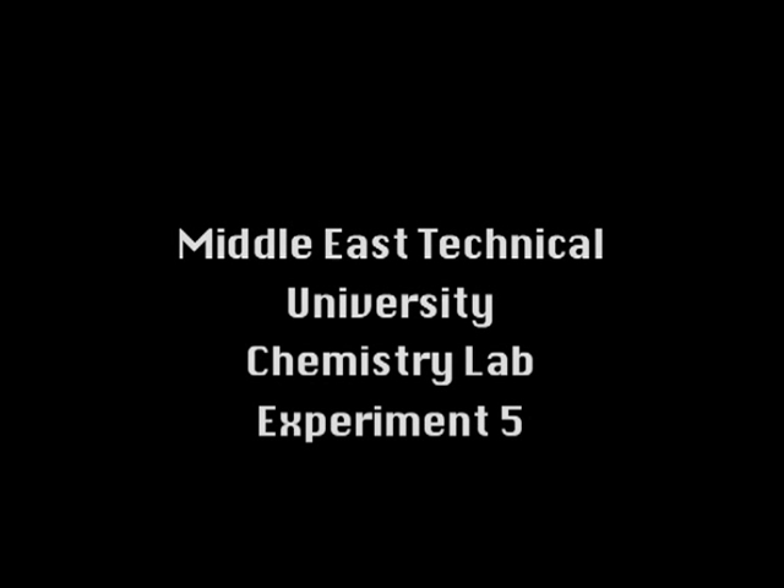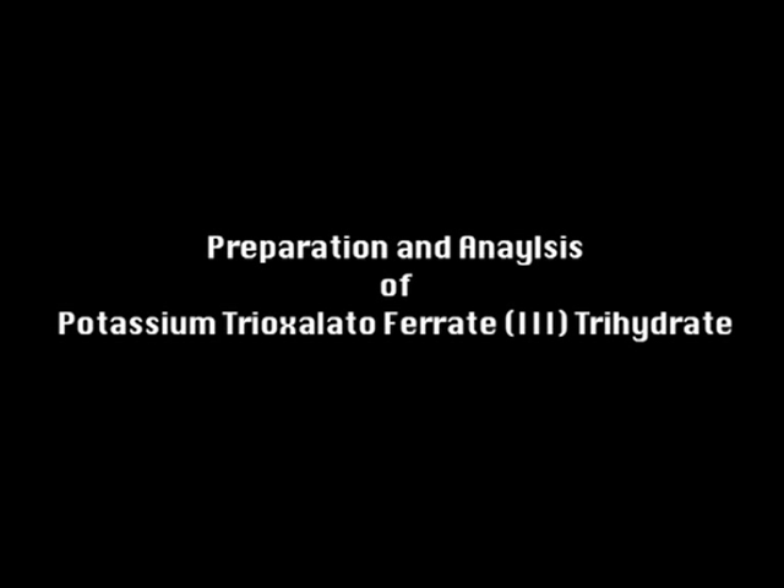Experiment 5: Preparation and analysis of potassium trioxalatoferrate trihydrate.